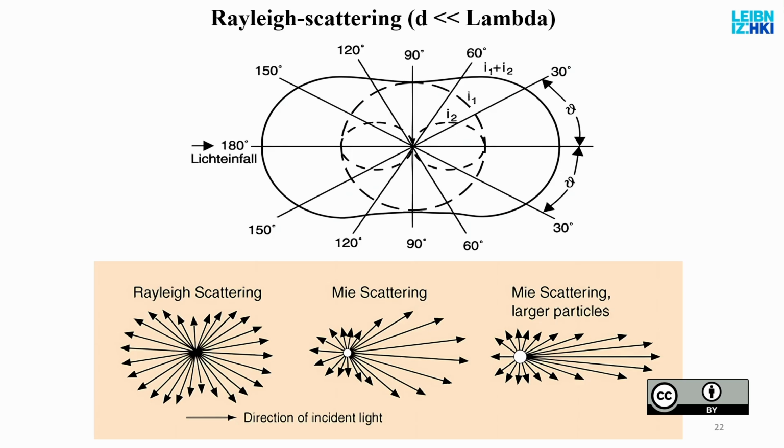Now, what does the sample do to make the life of an image analyst more difficult? Matter or tissue, cells, etc., will scatter light. And that's nothing to do with the lens. It has everything to do with the structure of the sample that we're looking at.